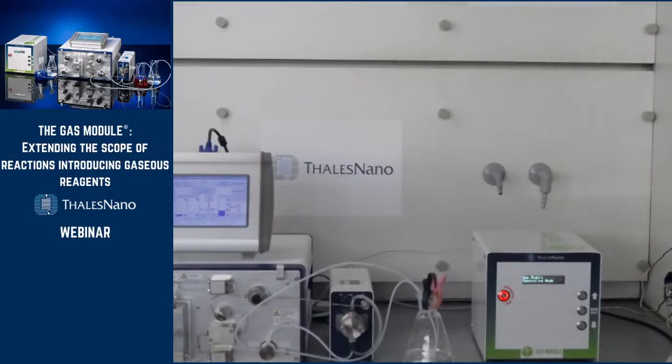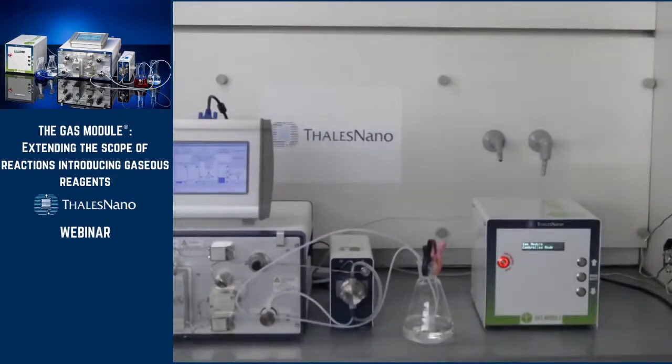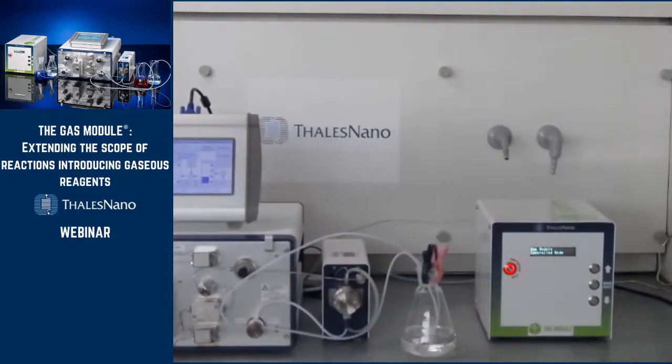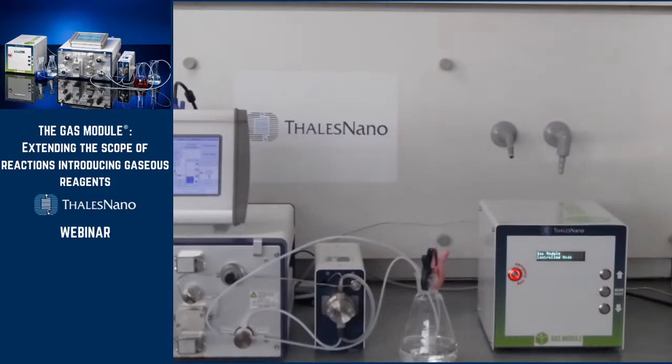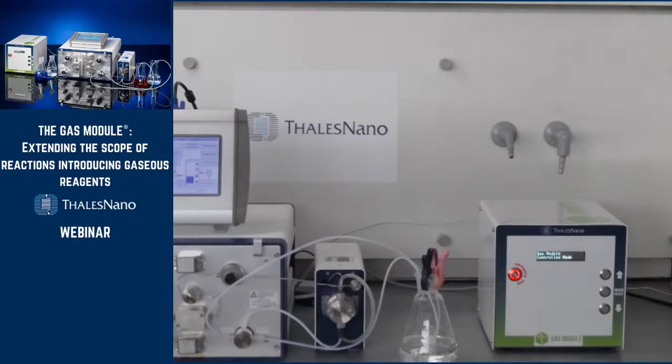So now, the same way we went through the liquid line, I'm going to go through the gas line here. So it starts with a cylinder. You cannot see it here as it is outside the field of the camera, but you have to have a cylinder in order to connect it to the gas module and inject your gas. You must have a reducer at your cylinder because the gas module can go up to 140 bars from the cylinder. And then your gas inside the gas module passes through the mass flow controller, which allows you to play between 0 and 100 milliliters per minute of flow rate, normal milliliters per minute.